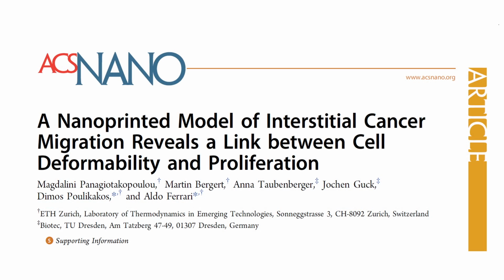In this paper, we studied interstitial cancer migration. In order to do that, we used 3D printed structures which mimic the pores of human tissue. Through our system, for the first time, we were able to link the cell cycle and the ability of cells to migrate through small pores.